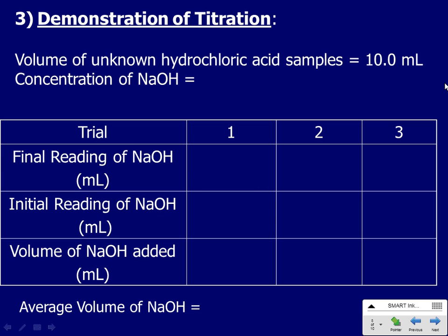First, let me grab some of my acid and some base. Here's hydrochloric acid. We're not going to be using hydrochloric acid, but this is just the one that I have grabbed to do the demonstration. And then we obviously need some base. And you need about 100 mils of the base. You might have to go back and get some more with a 100 mil beaker. So put it up to about 80 so that it's not super full, but that's not too bad.